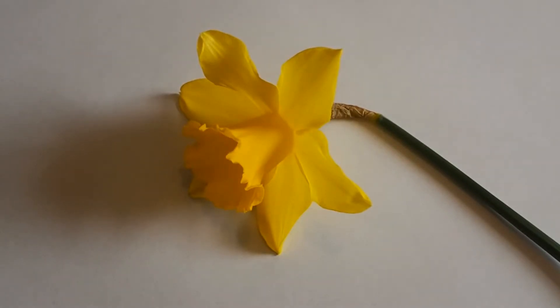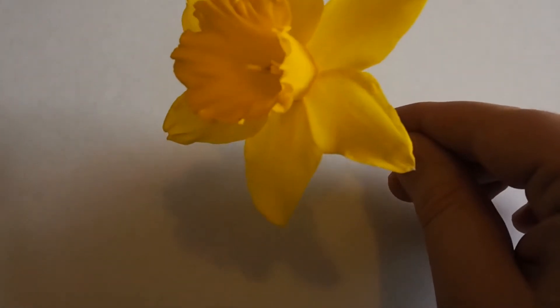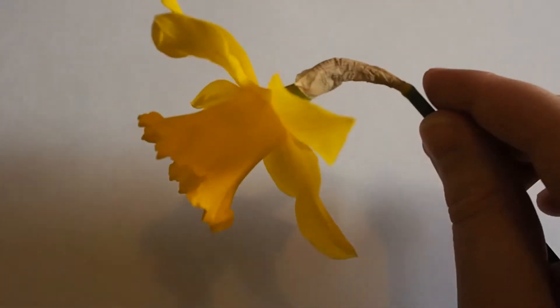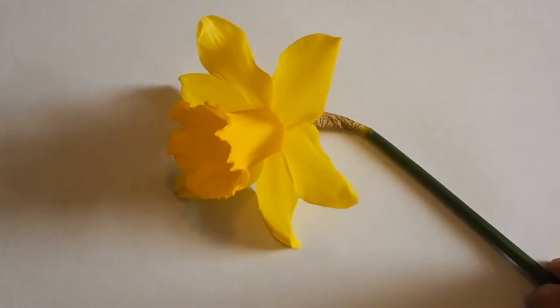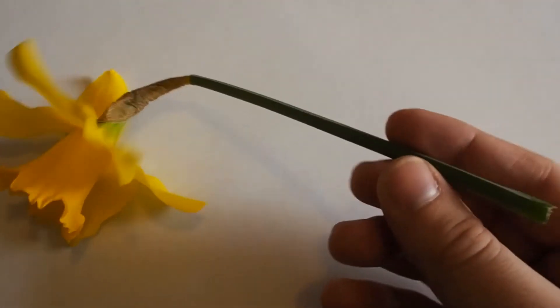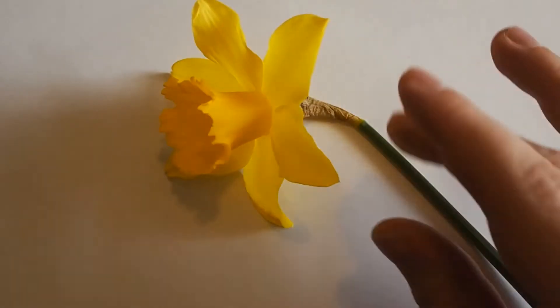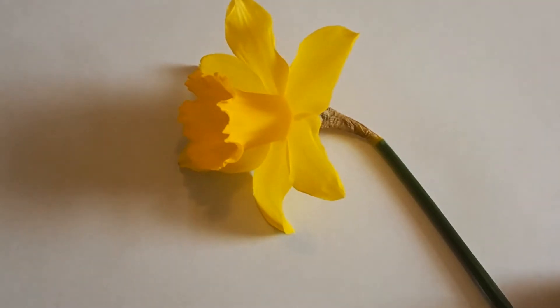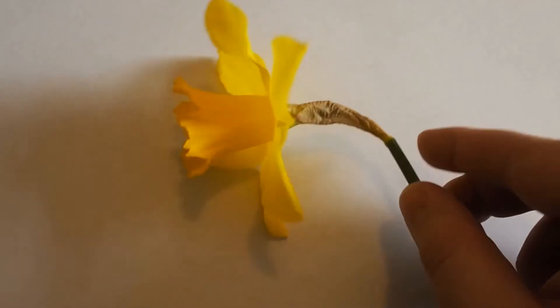In today's lesson, we're going to be having a look at how flowers work, and we're going to do that by dissecting a daffodil. This is a lovely daffodil out of my garden. What I've done is I've just cut this off at the stem, so we're interested in this part of the plant. The first thing we're going to look at is something you might have always thought was a bit scruffy on the plant.